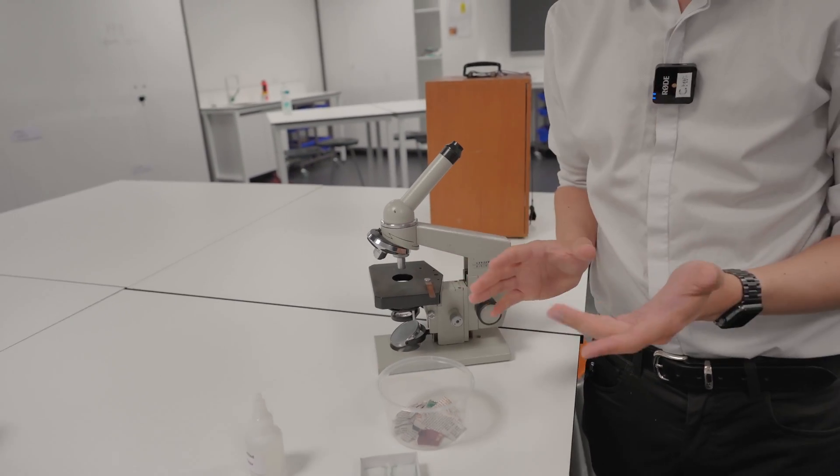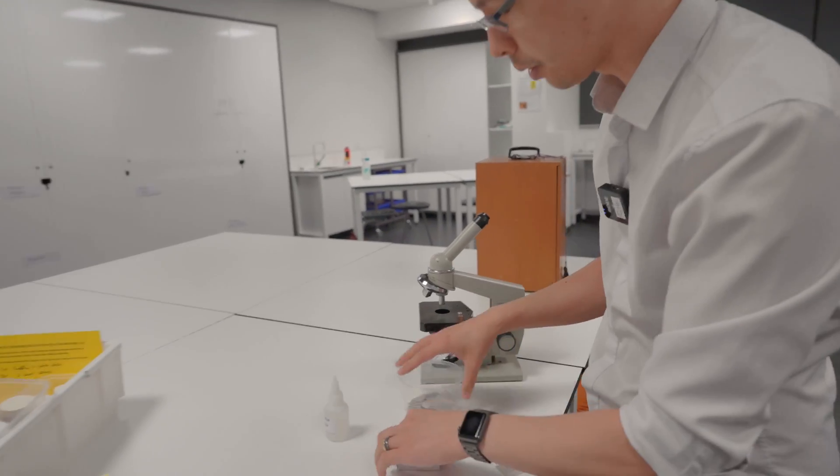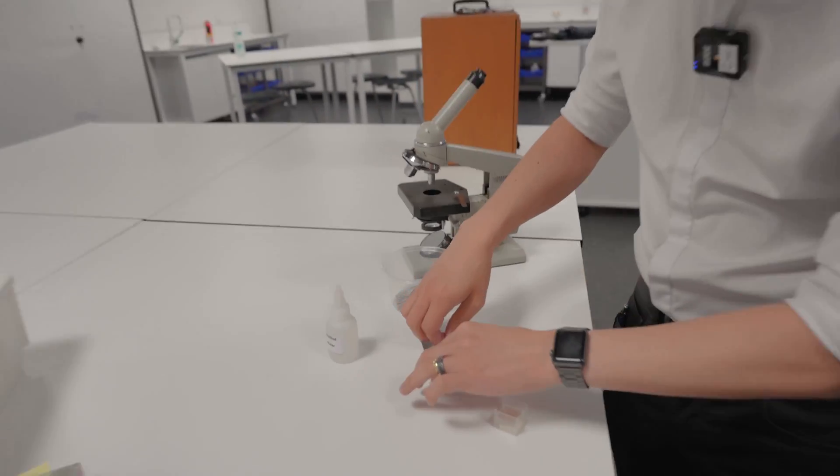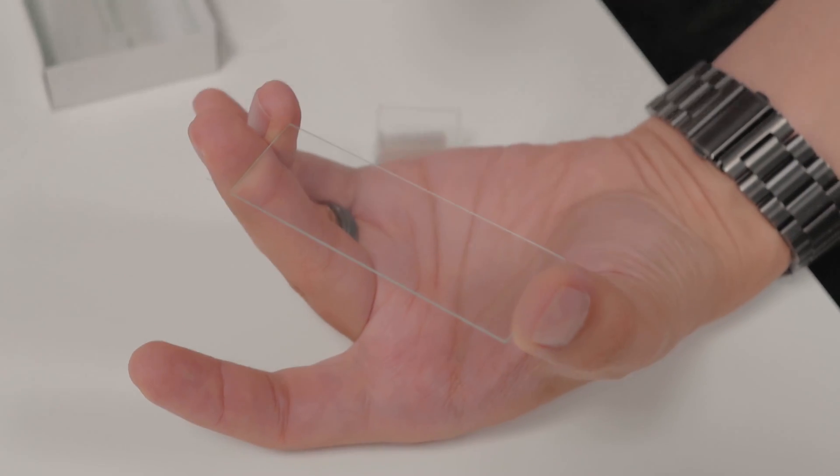We're gonna walk you through how to create a wet mount and then we'll go over the process of how to focus this thing. So you're going to have two items to create a wet mount. This is called a glass slide. The cleaner the better.